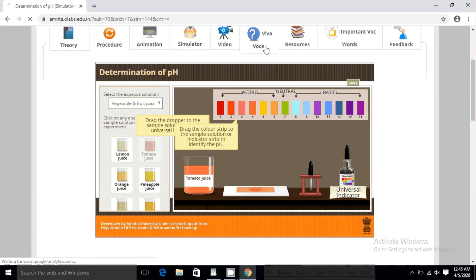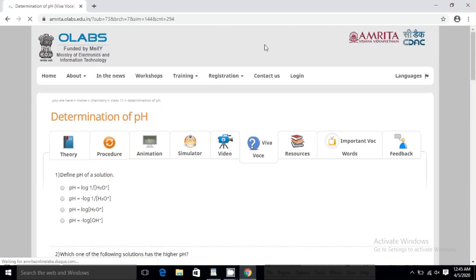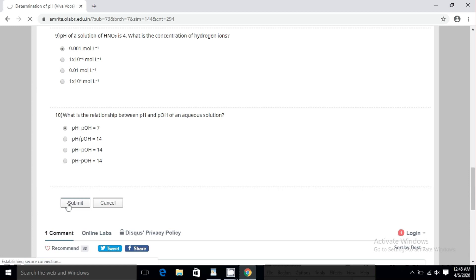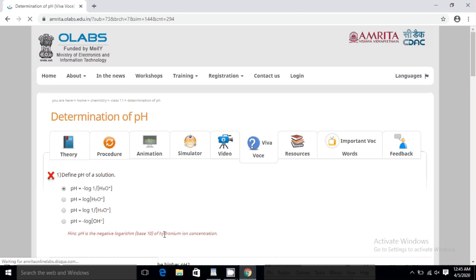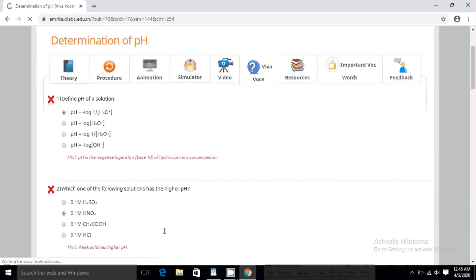Lastly, you can save this project. There is also a Viva Voce section where you can test yourself, and then you can submit it. I have already told you I am not an expert, and that will reflect in my Viva Voce answers.